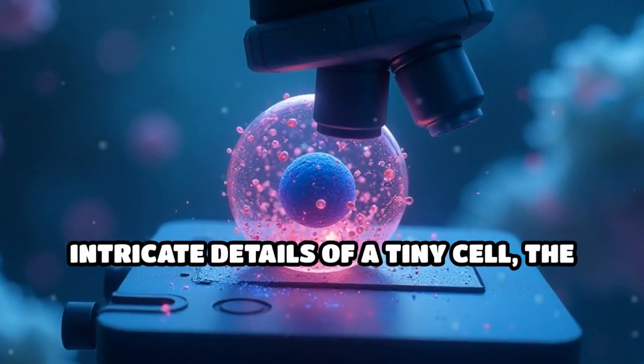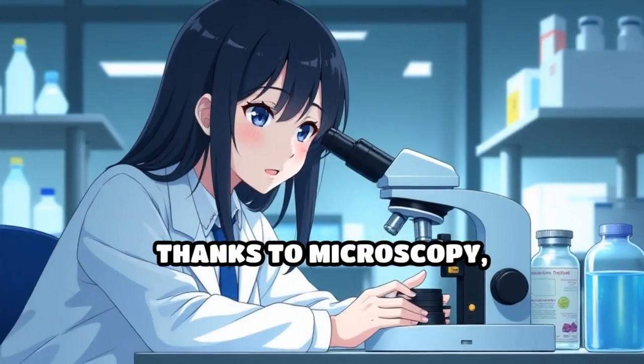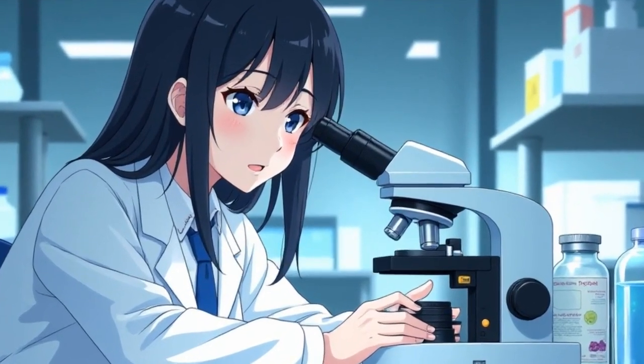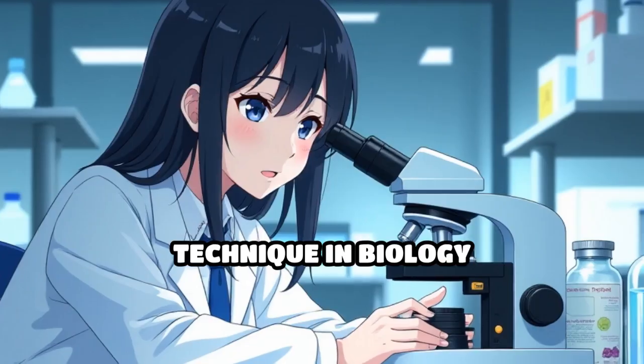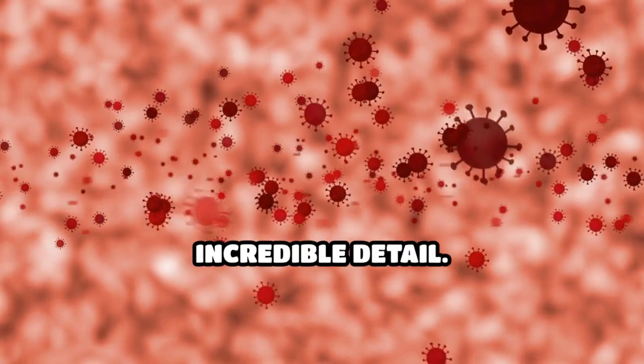Imagine being able to see the intricate details of a tiny cell, the building block of life. Thanks to microscopy, this is possible. Microscopy is a fundamental technique in biology that allows scientists to study cells and their structures in incredible detail.